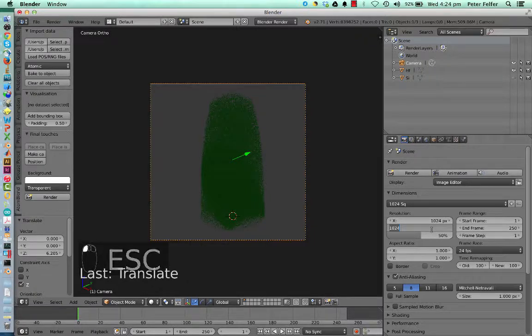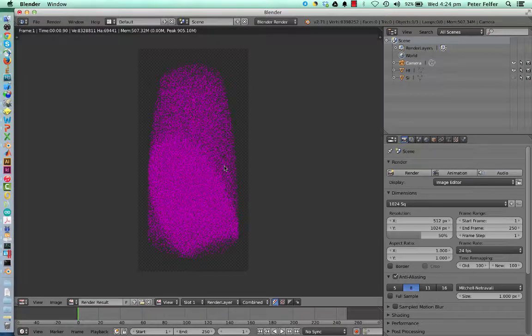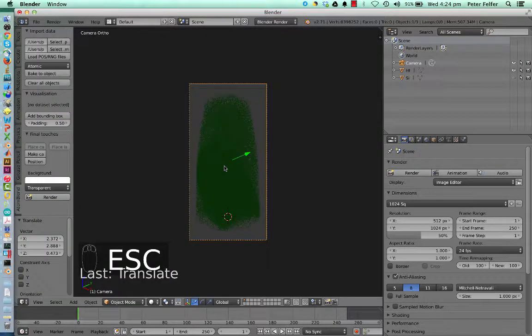Even though in this case we might want to go and change X to 512, and you can see it still fits, and that also saves you a little bit of space. So what do these things all mean?